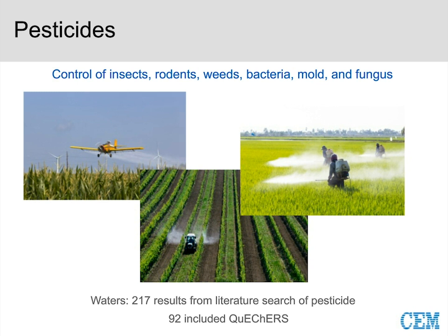So basically, if the sample preparation was noted, it was QuEChERS. So I recognize that primarily in extracting pesticides from foods, the method that people are using is the QuEChERS method. So I certainly am going to pay attention to that in this presentation as I talk about an alternative to that QuEChERS method.